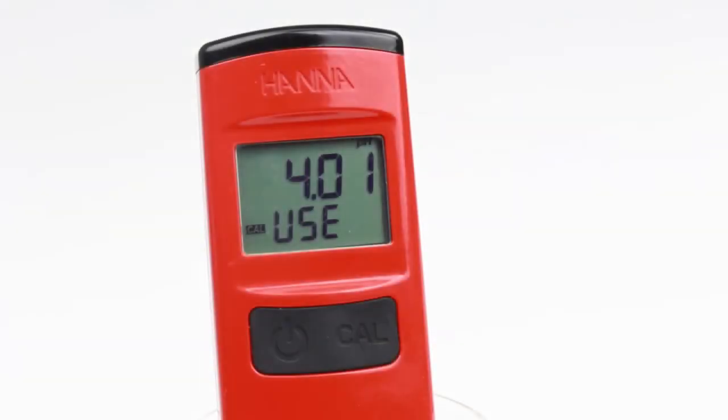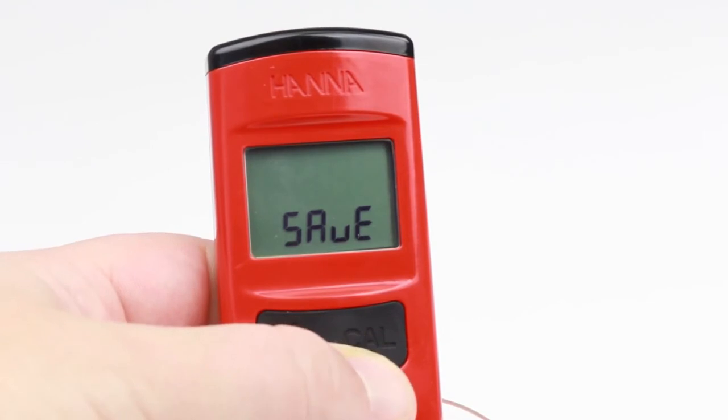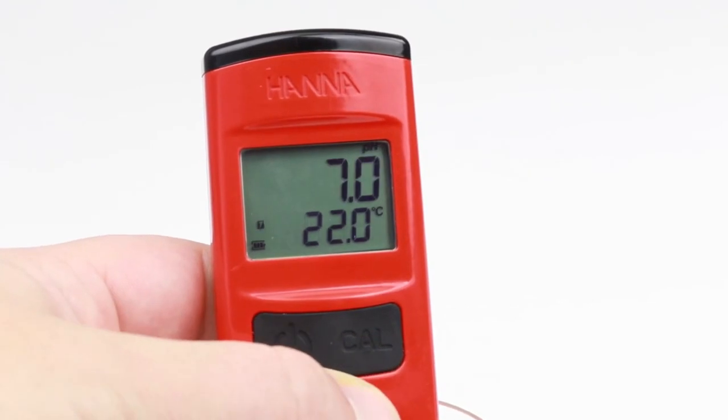For single-point calibration, press Cal key to exit. Save message is displayed and the meter returns to pH measurement mode.